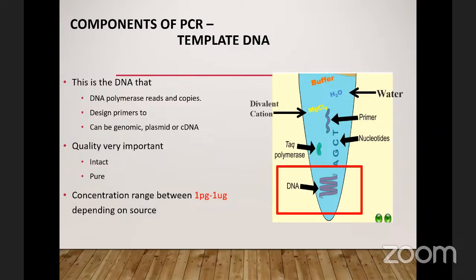So when we are talking about PCR amplification, in the first place, what is being copied? We said PCR is like molecular photocopying, where you can make several copies of the few copies of DNA that are present in a sample. So the copies that were originally present are the template DNA. It is from here that DNA polymerase can make several copies, and this is what we design primers to target.